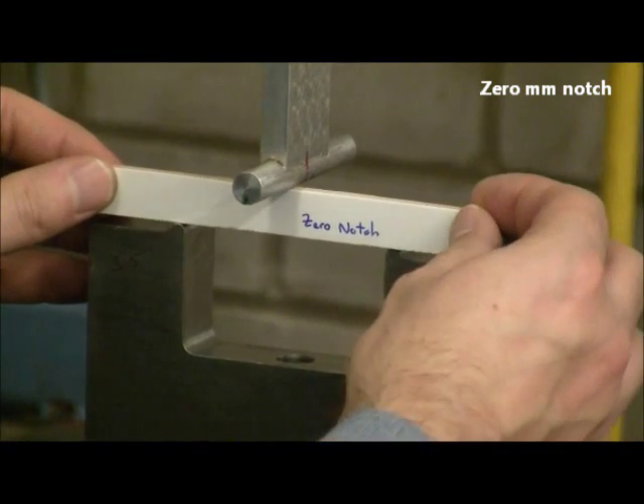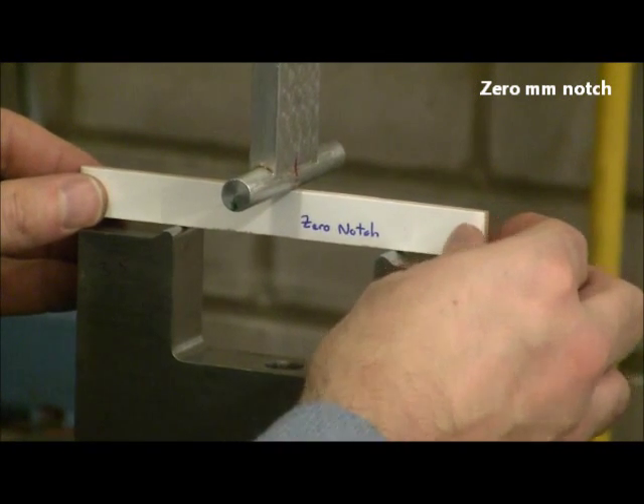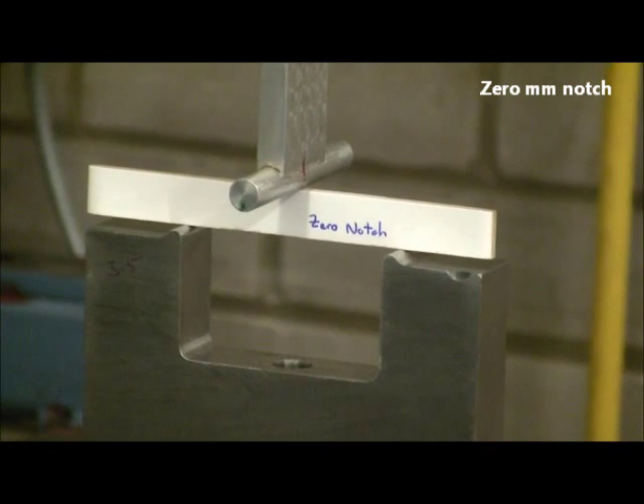This is the zero-notch sample being loaded into the jig. There are two supports at the bottom, with the load applied from the central one at the top. The load is now being applied with very slow movement of the crosshead above.